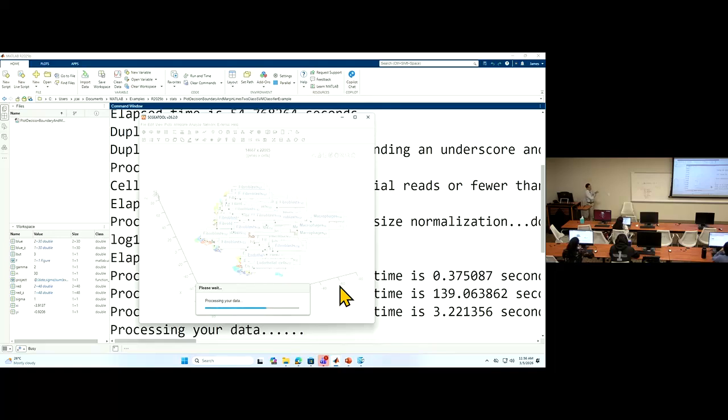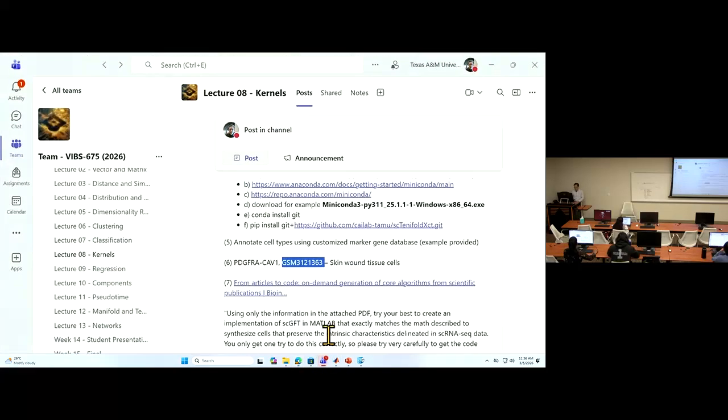So we are going to use this annotation to look at ligand receptor genes expression. A set of selected genes, the names of the genes are given in this.